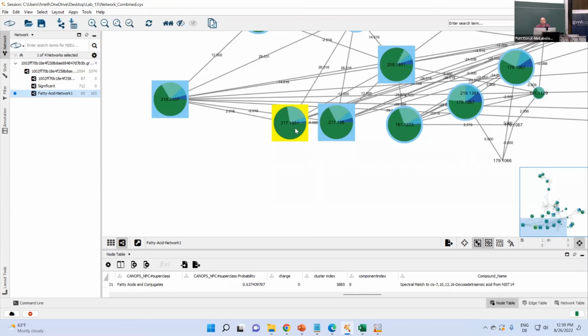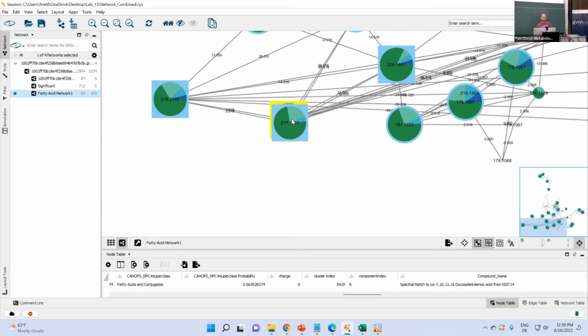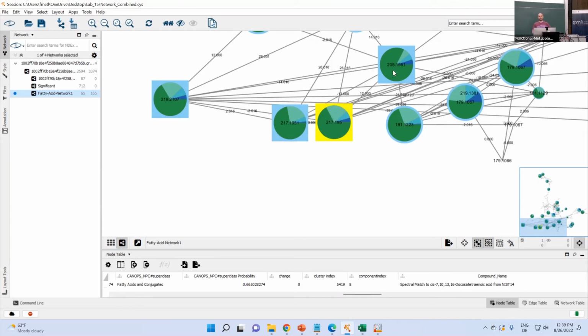So now a question that I would wonder is, are those actually 2 resolved chromatographic peaks, or are they maybe split features, right? Because if they're split features, then maybe I should not report them as 2 individual nodes, but merge them. Or if that happens very often, then maybe I should reconsider my feature finding. That would of course be bad, because then I have to go back into the entire thing again. Fortunately, all your data analysis was in some sort of script form, so if you have to redo this, it should be fairly fast to reprocess and push through the pipeline.